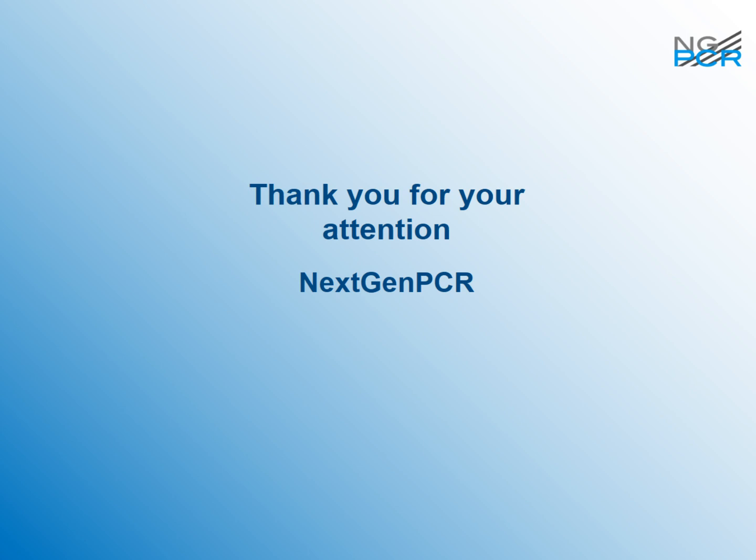No, well, thank you for that. Next one here. Can we only use plates on these machines? Can we use individual tubes or 8-tube strips?